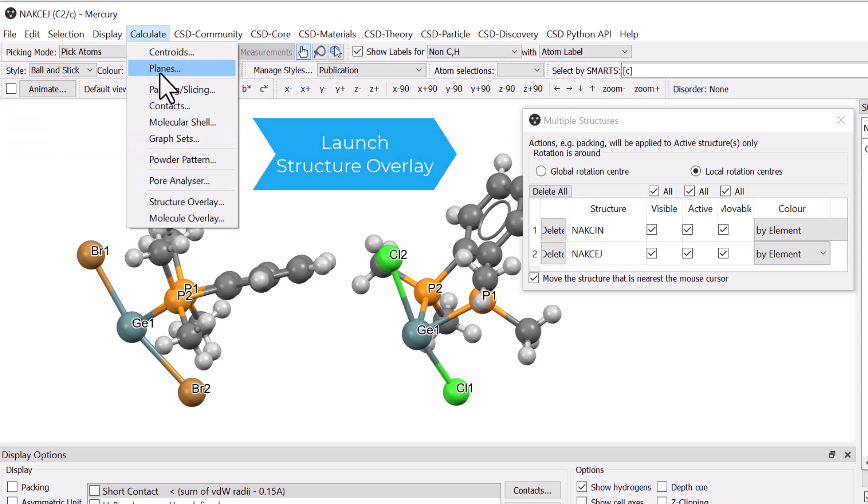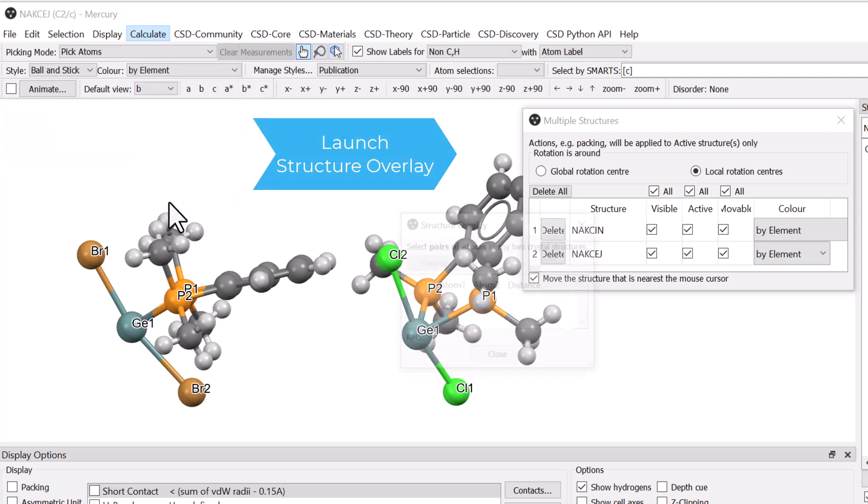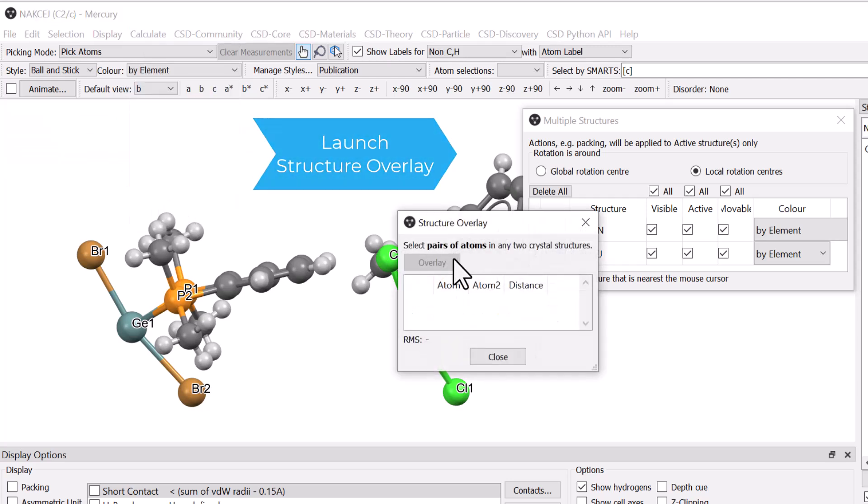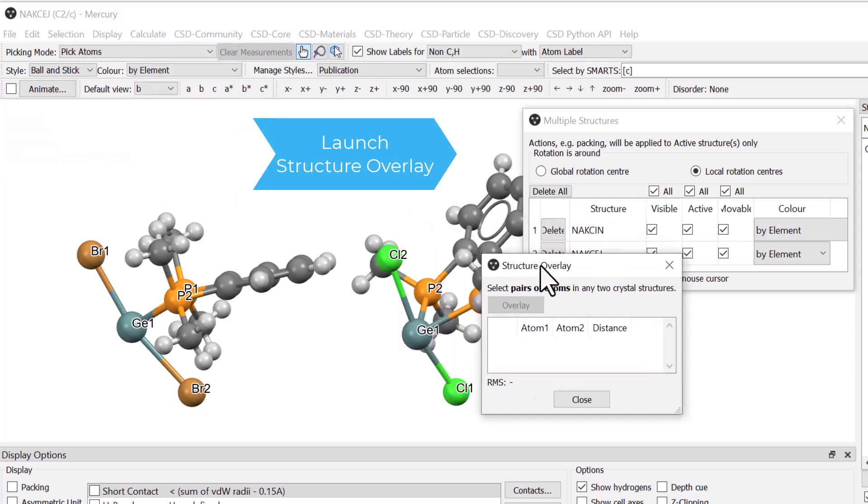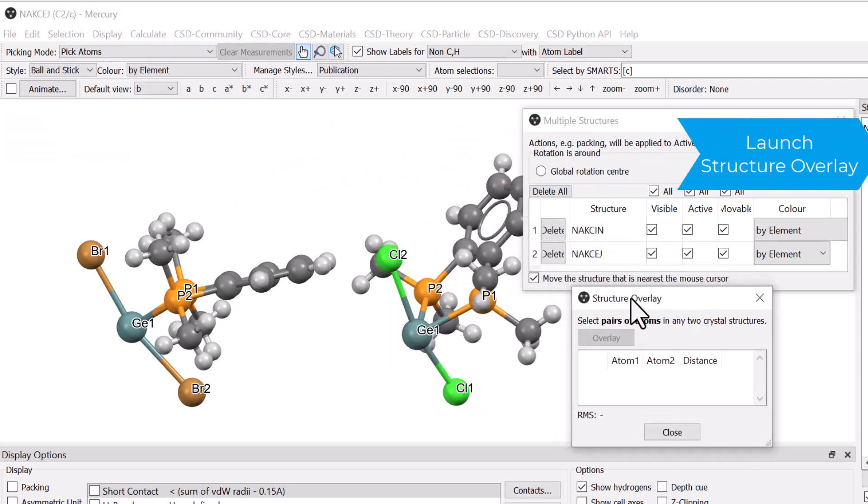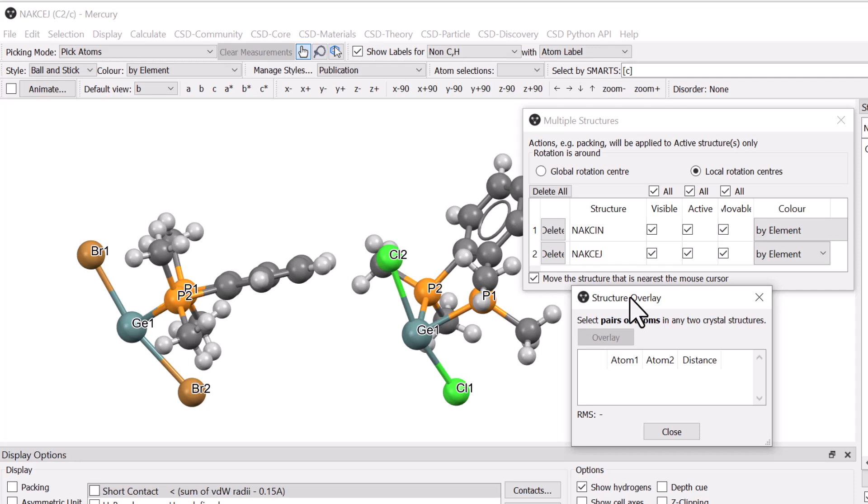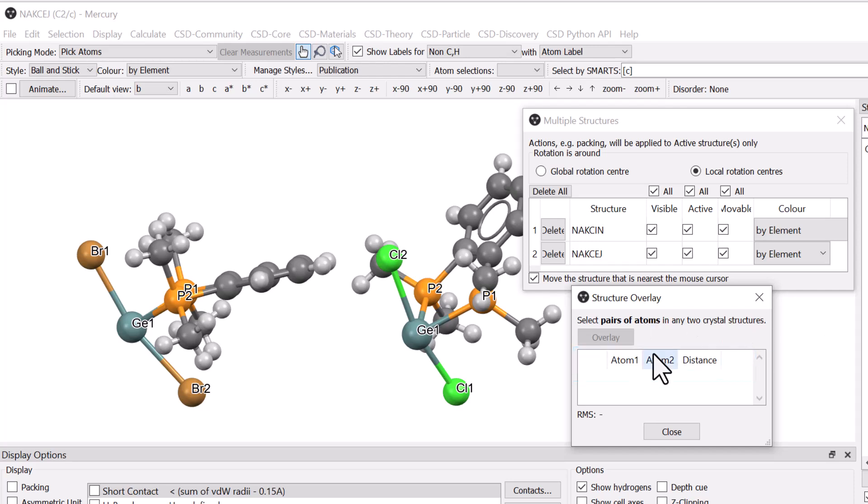Go to the Calculate menu and select Structure Overlay. This will open the Structure Overlay window. In the table, you will see the column headings Atom 1, Atom 2 and Distance. You need to select at least one pair of atoms to use the overlay, but you may select more depending on what you wish to compare.